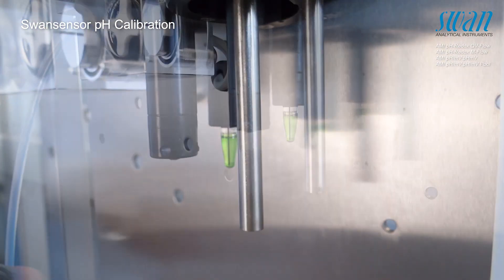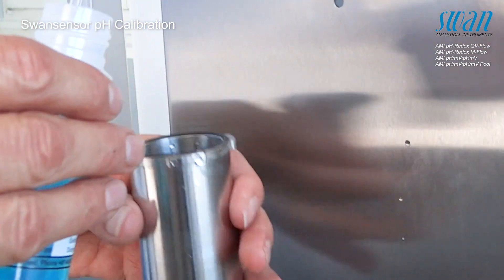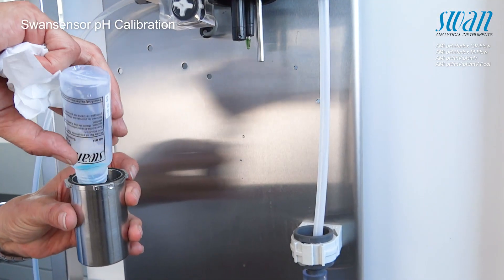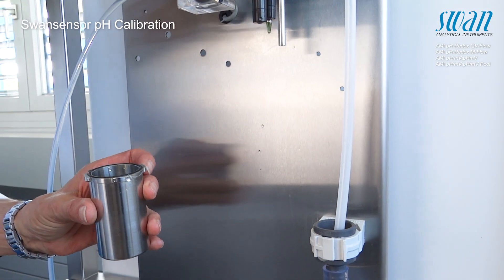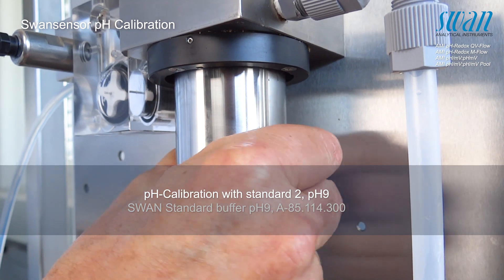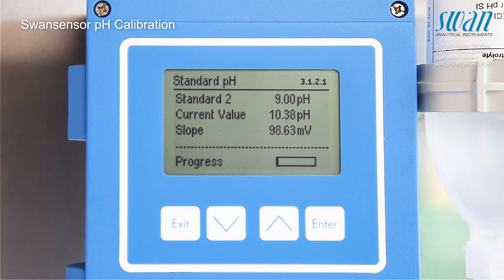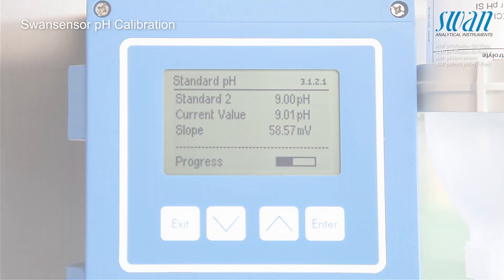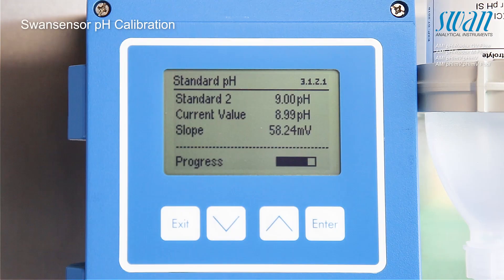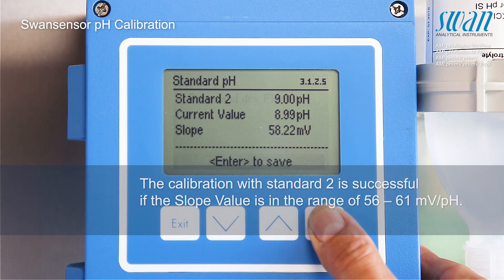Rinse the vessel with water and standard solution 2 with pH 9. Then fill standard solution 2 into the calibration vessel. Attach the calibration vessel to the flow cell and continue by pressing enter. Press enter to save the calibration with standard solution 2.